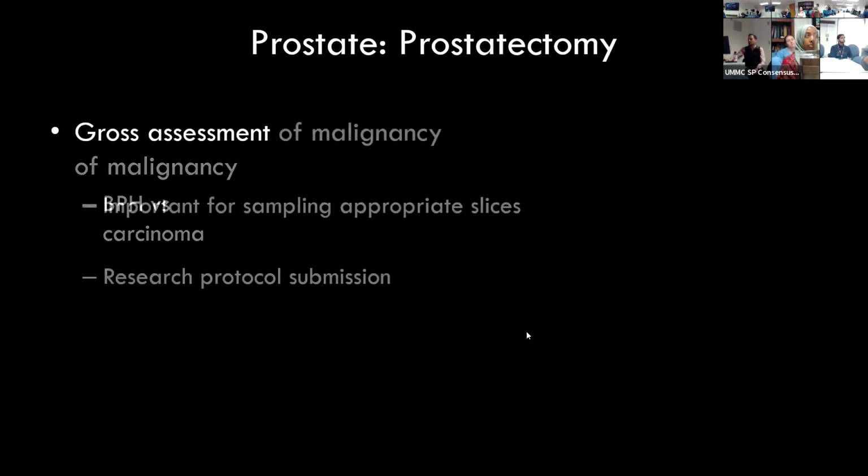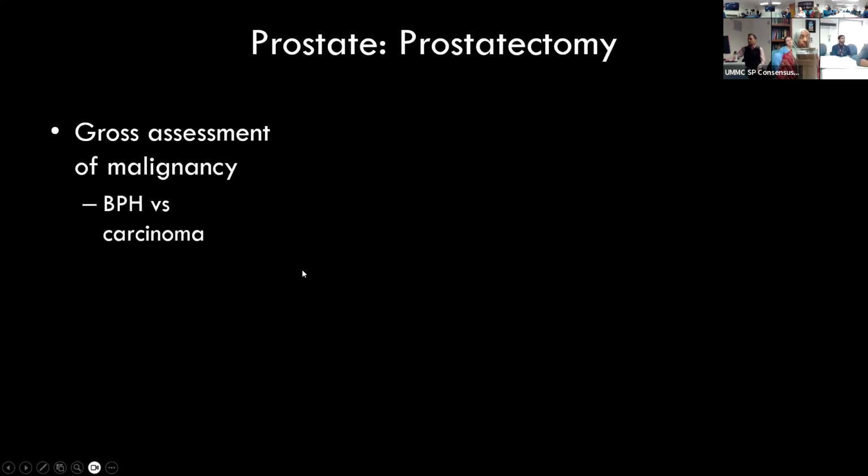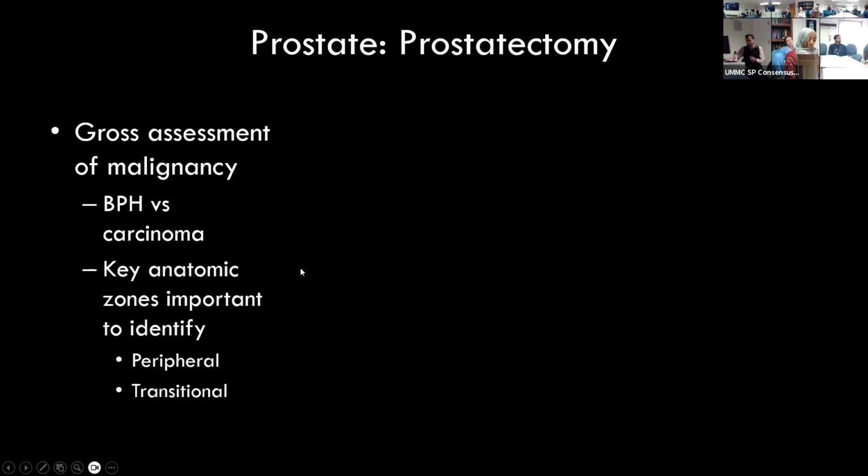Okay, and then we do have several research protocols in which it's good to identify prostate cancer correctly in the gross specimen, without having the advantage of microscopic examination. So it might be good to know what is prostate cancer versus a BPH nodule on gross assessment. So let's take a look at that.